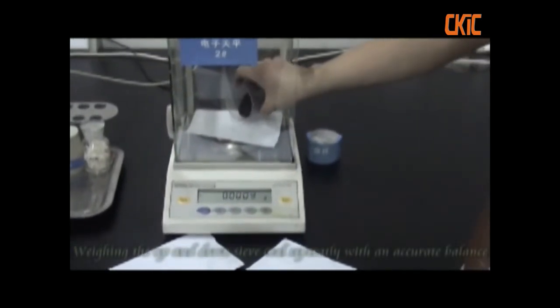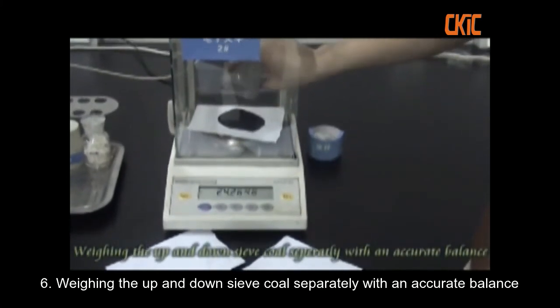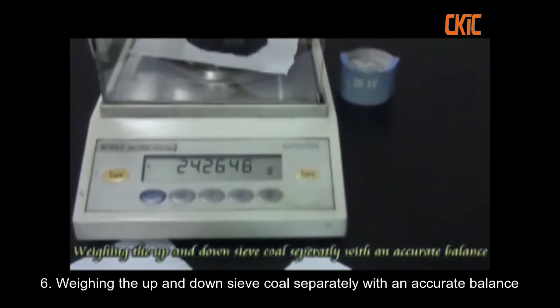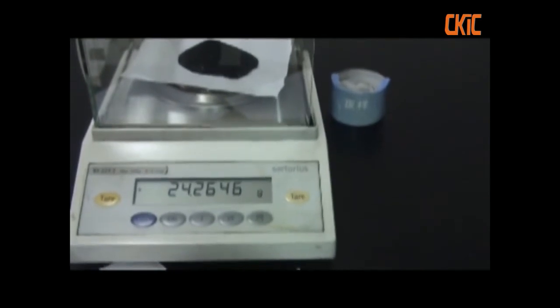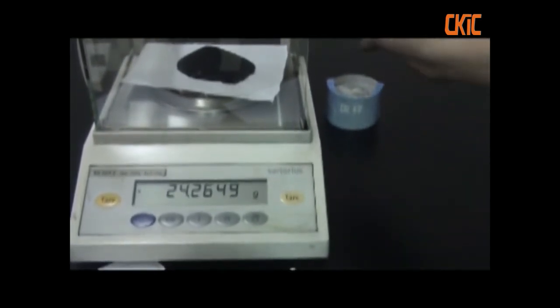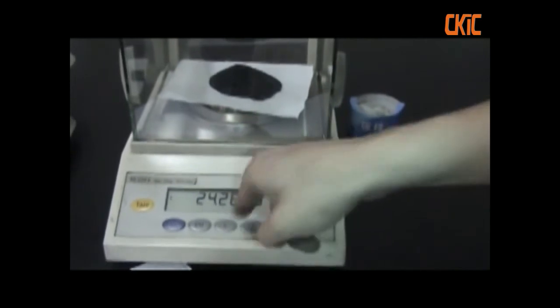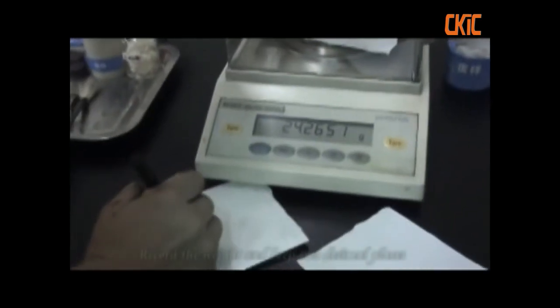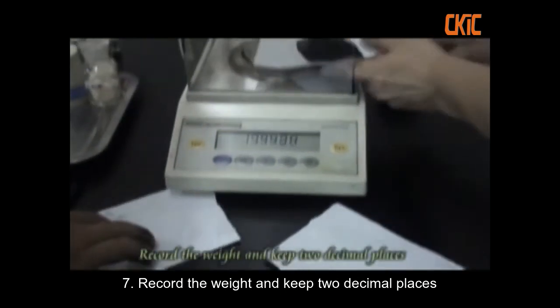Weigh the upper and lower sieve cores separately with an accurate balance. Record the weight and keep two decimal places.